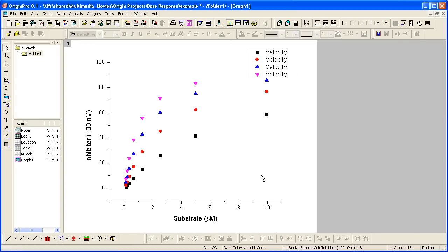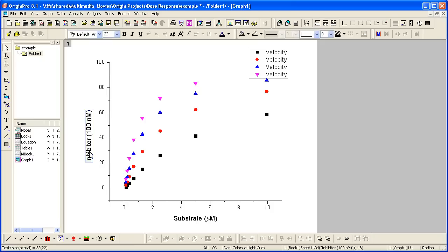Notice the legend is the same for all the curves. So what I'm going to do is change this. In fact, before I do that, I will make the y-axis title to be velocity, which was in the legend.